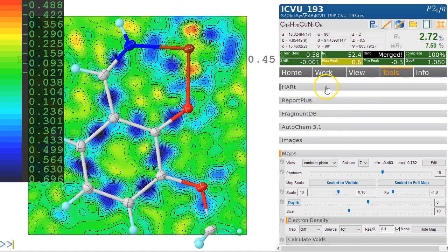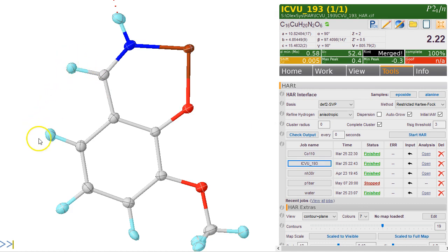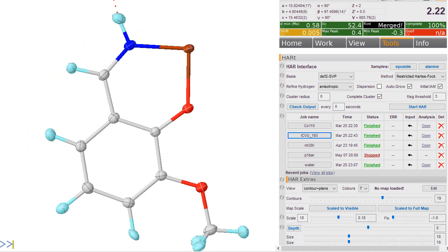This is a structure I have run the Hirschfeld atom refinement on. If you go over to Hirschfeld atom refinement and load the result, first of all, the hydrogen atoms have all been modeled anisotropically and refined freely.